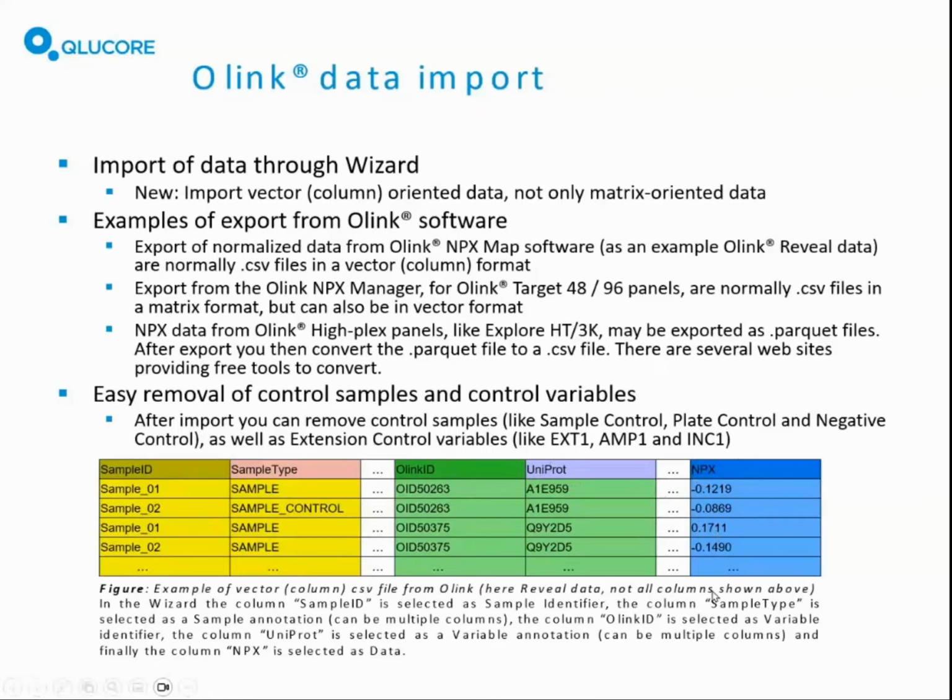And in export of Olink data, you will get normalized data, so you don't have to do a normalization afterwards. I will show this also in a demonstration here with a dataset.